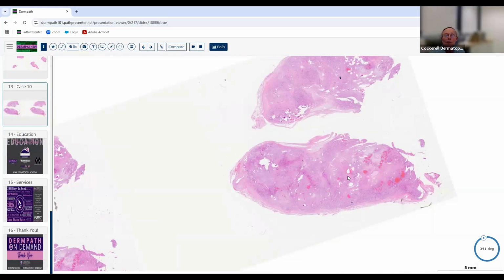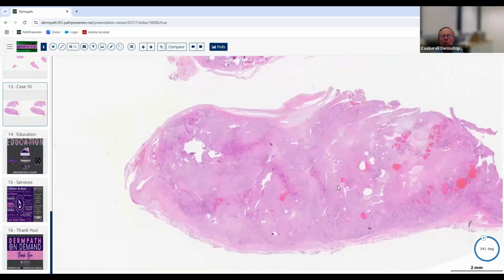They take a little incisional biopsy and they kind of shell it out, and that's a classic story for adnexal tumors also. They don't really think that they're adnexal tumors. They think they're cysts, unless they've got some unusual morphology to them. So low magnification, probably benign, enucleated, pretty symmetrical. It's got some bluish cells in here, some cells that are pinkish. Is it epithelial? Well, it doesn't look like classic epithelium. Not really sure exactly what kind of differentiation is here at this power, but probably benign, and we're going to go to higher magnification, see if we can tell.